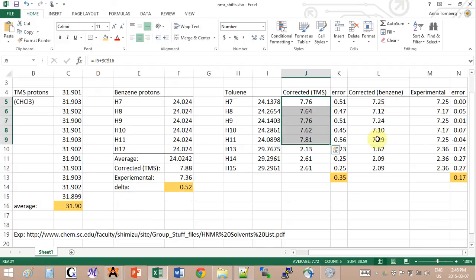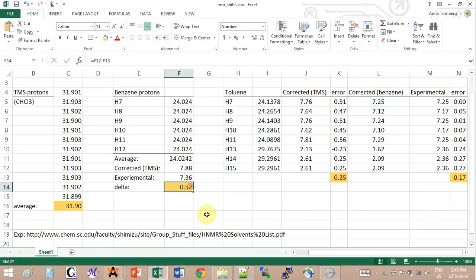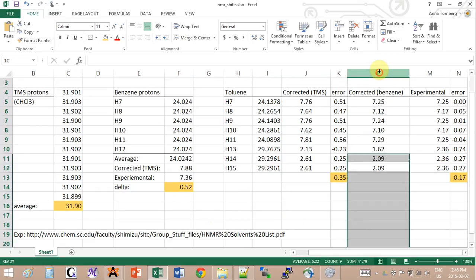So that can hint us to the fact that maybe we should add a second level correction to our already corrected value. What I did is I decided to add this error that I had for benzene into the calculation for the toluene. What I did is I took those values - the shift corrected by TMS - minus the error that I got here. This gave me this set of values over here.